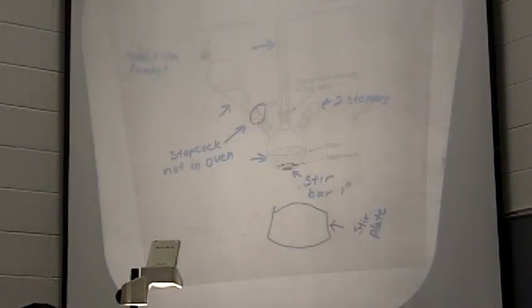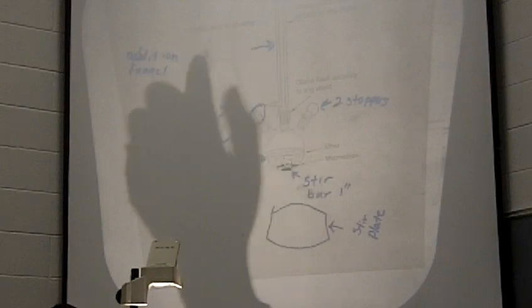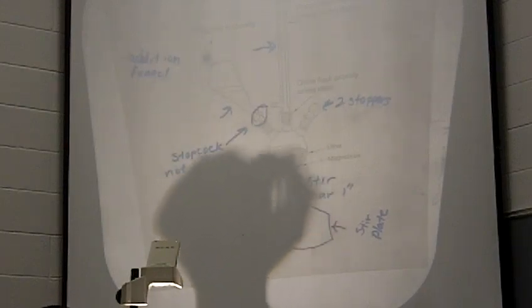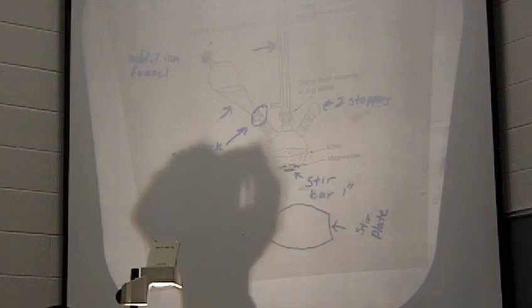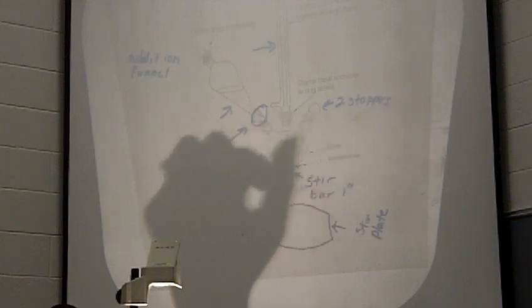Now, your lab manual then talks about the iodine. We're going to add iodine to this before we add our alkyl bromide. The iodine goes in because it etches, it cleans the surface of the magnesium. It helps get all that magnesium oxide off the surface. That is what forms from the magnesium reacting with the air. So that's why you don't want it sitting out in the air. So we're going to clean it with that iodine and get it all cleaned off, okay?